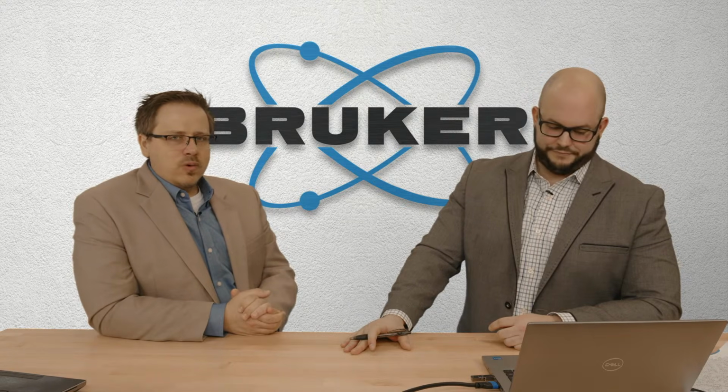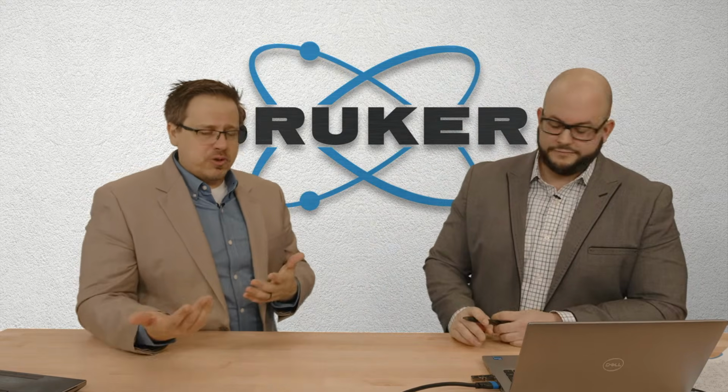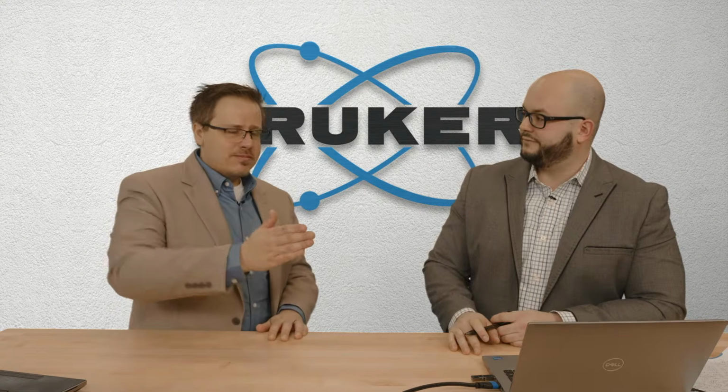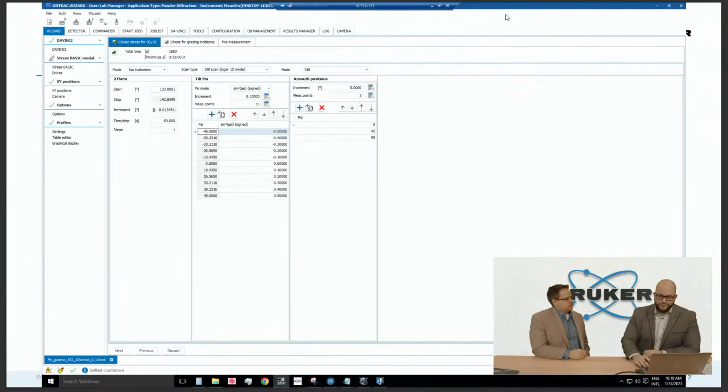All right. So with that, we're going to start taking a look at how you'd actually execute a measurement like this. With our machines, we have this mantra: plan, measure, analyze. So we'll start out with planning. I have put together some screenshots of how you'd go about the planning process in our software to put together a residual stress experiment for an iron-based sample, changing the experimental parameters to extract different stress components in our stress tensor.